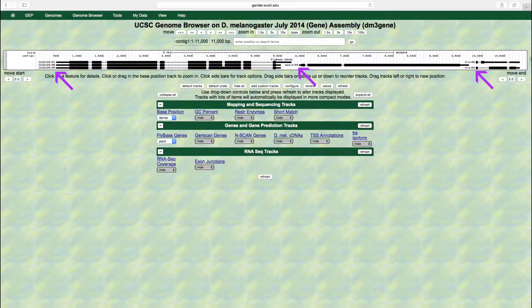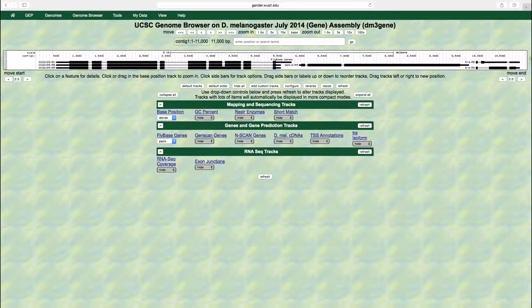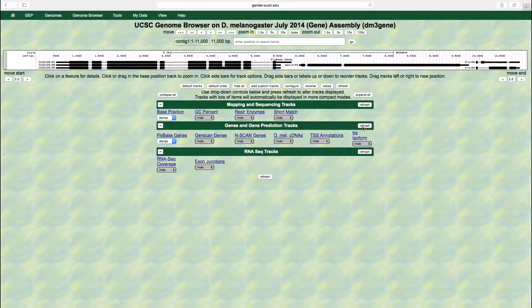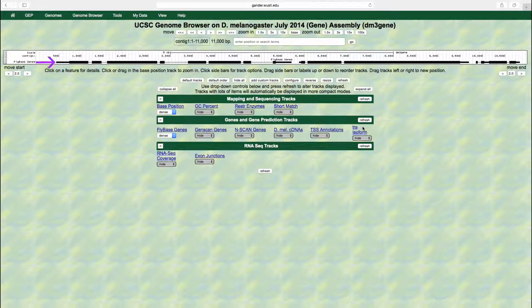Many evidence tracks have different display modes that you can use to control how the UCSC Genome Browser renders overlapping features. For example, let's change the display mode for the FlyBase genes track to dense and click refresh. The overlapping features are now rendered in a single line.